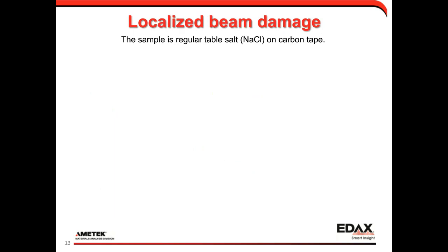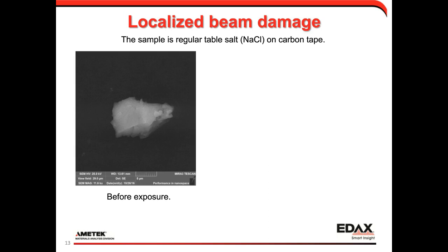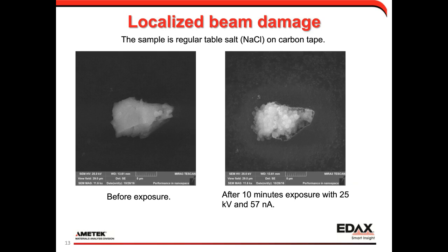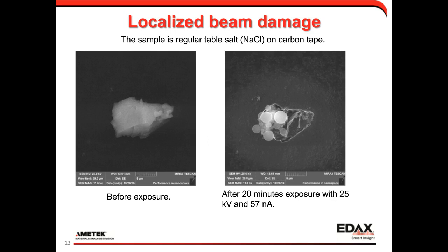Now let's break some things. I took regular table salt — sodium chloride from our cafeteria — crushed it, mounted a small grain on carbon tape, and first imaged it at low current just to confirm it's NaCl. Then I exposed it to 25 kV, 57 nanoamps for 10–20 minutes. The result: the salt grain looks completely transformed — it appears as though we're boiling material off the surface.